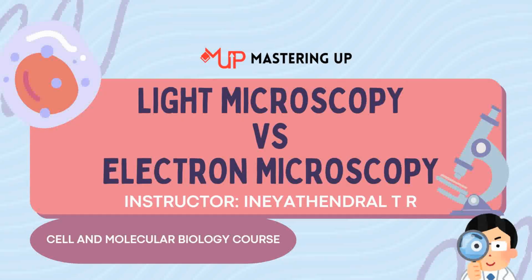In the previous video, we saw a brief history of the microscope, followed by how a light microscope works, and then how to view a slide under a microscope, followed by the types of light microscope. In this video, we will see the key differences between light microscopy and electron microscopy.